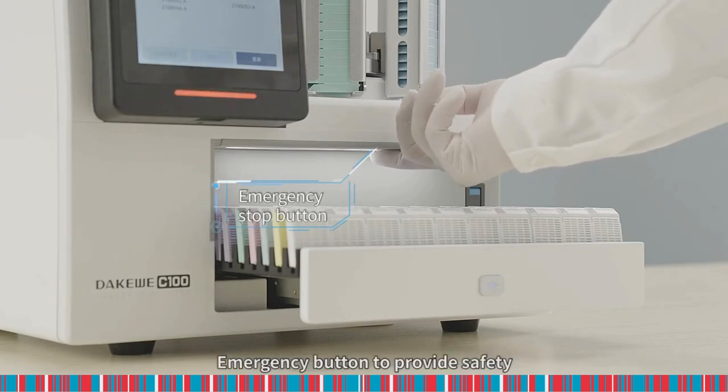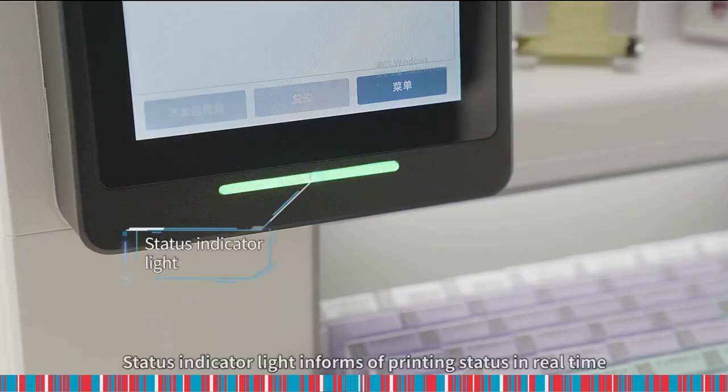Emergency button to provide safety. Status Indicator Light informs the printing status in real-time.